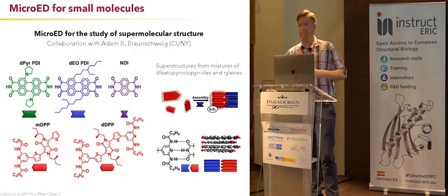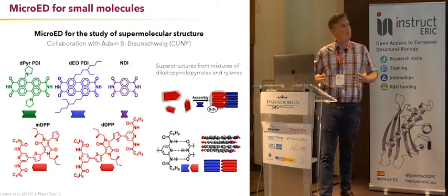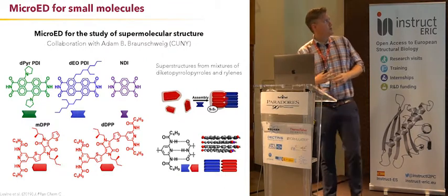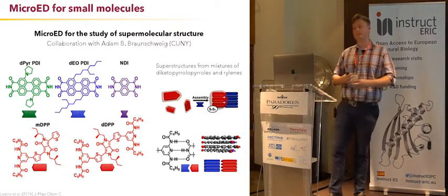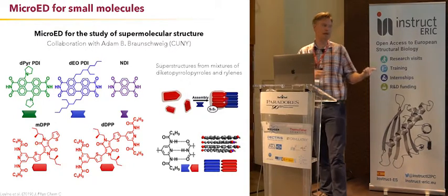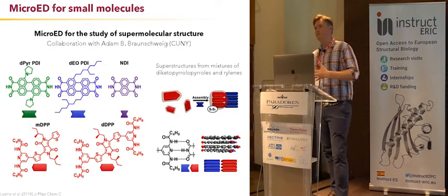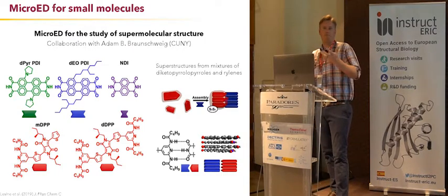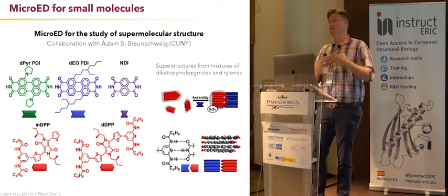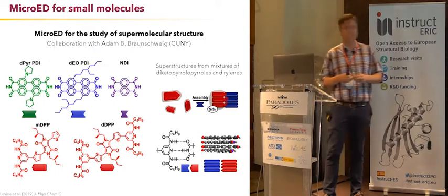And so I'd be happy to talk about that with anybody afterwards, but one of the areas that's getting popular right now, and I was asked to talk about, was using microED for small molecules. This has recently got popular. A couple of groups, my old postdoc lab and a few other labs in Europe, showed that you can just take raw powder from some organic synthesis, put it on a grid, and solve high resolution structures right from the unpurified material.